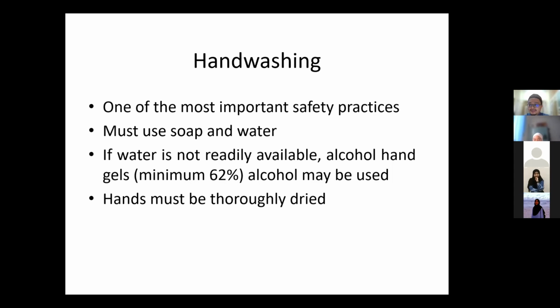One of it is if you use hand sanitizers, some of the hand sanitizers that are available on the market may not be according to standard. Okay, awak boleh check hand sanitizer. Mungkin awak pun ada juga dalam bag masing-masing. You buy the commercially available hand sanitizers. It is only good, only effective when the alcohol content is more than 70% or at least 60%.